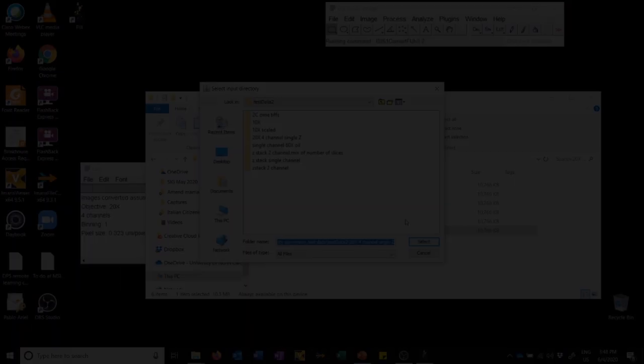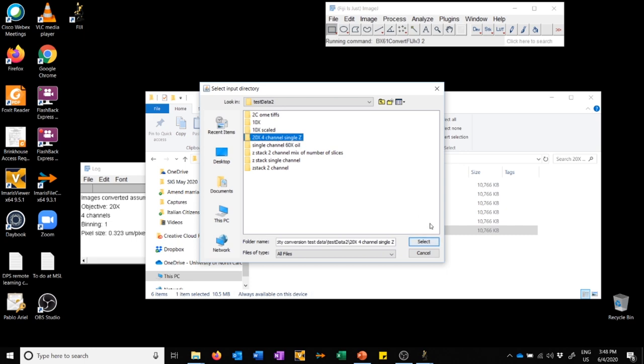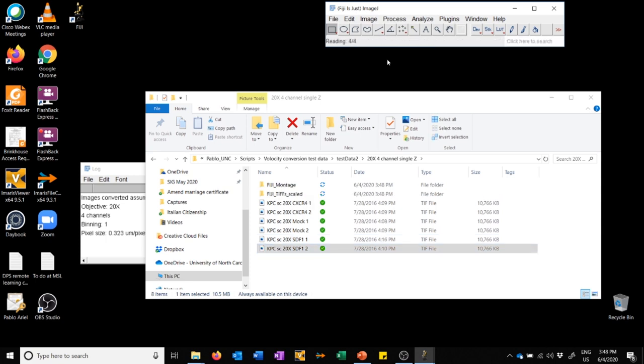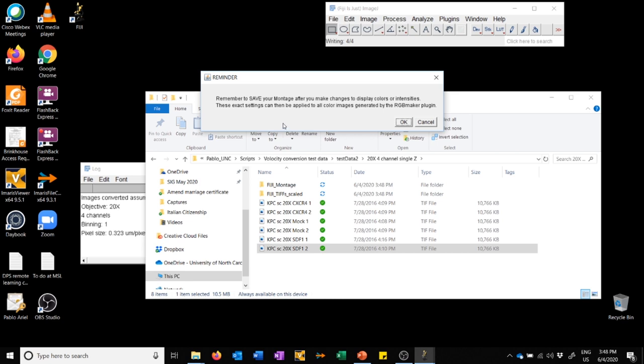The first thing the macro is going to do is ask us where the data we're interested in is. In this case we're interested in data in this folder, so I'm going to click on that and say select. Once I do that, the macro starts doing stuff, which you can see because there are numbers here and things happening. You can also see I have the particular folder here, and it created subfolders. Then it gives us a reminder: remember to save your montage after you make changes to display colors or intensities, and these settings will be applied to all color images generated by RGB Maker plugin, which is the next plugin we're going to use. So I'm going to say OK.